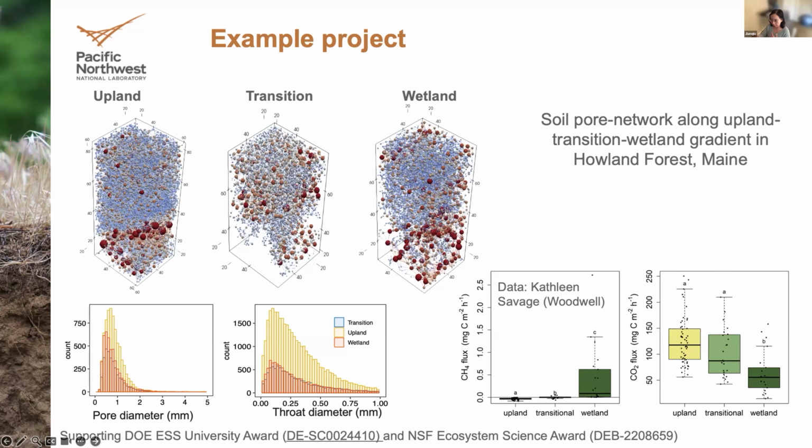Here, just at first look, the upland soil seems to have a much more complex soil pore network. We were hoping that this may help us explain some of these patterns in the CO2 emissions. These are just small ongoing projects we're doing.